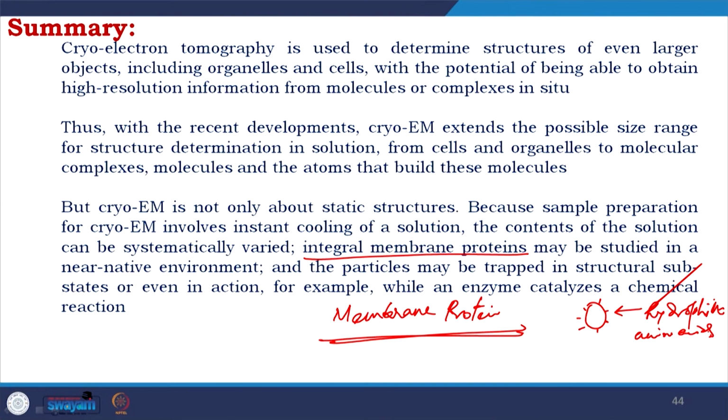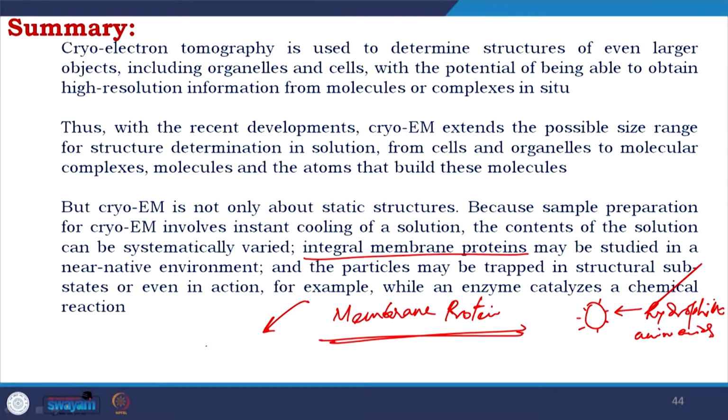For the membrane proteins, they have hydrophobic residues at the surface, so they could not be solubilized. So, to solubilize they need perfect conditions, and that is why it is really very difficult to work in both crystallography and NMR, not here. You could directly get the membrane, freeze it and get the structure.